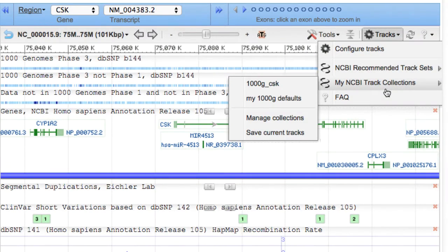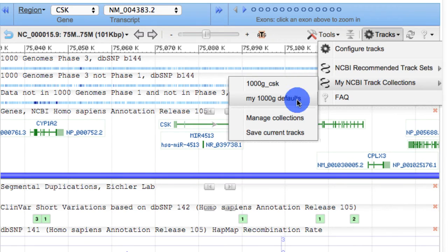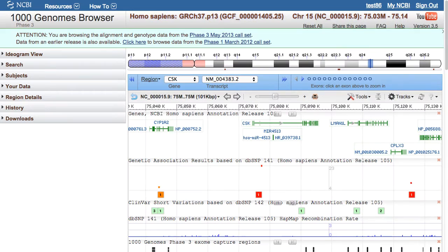Now I can see my existing track collections. Notice that mousing over a collection displays a list of its tracks, and I can save the current set as a new collection. Clicking on a track collection loads the corresponding tracks into the display.